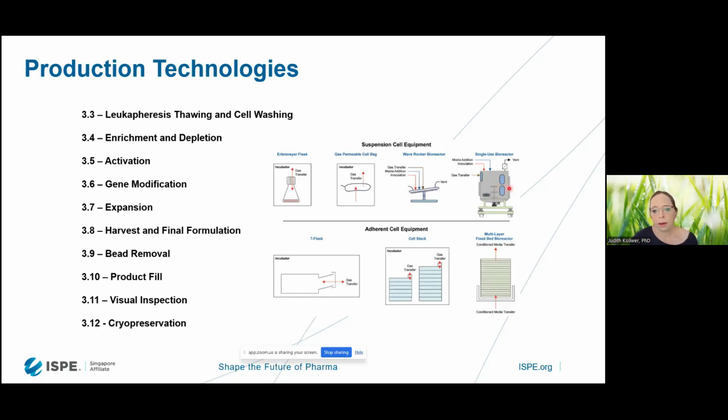Here, a consideration that we have very much seen is, of course, a cost factor, because, for example, when it comes to growth factors, they are really one of the biggest cost factors when it comes to our material. So definitely important is the volume with which we want to work, and of course the volume being dependent on the bioreactor or vessel that we are using to incubate the cells. Other than that, we definitely see, if we're not using the module of a cell processor, that this can be done in a manual step using the isolator and then putting them back into the incubation.